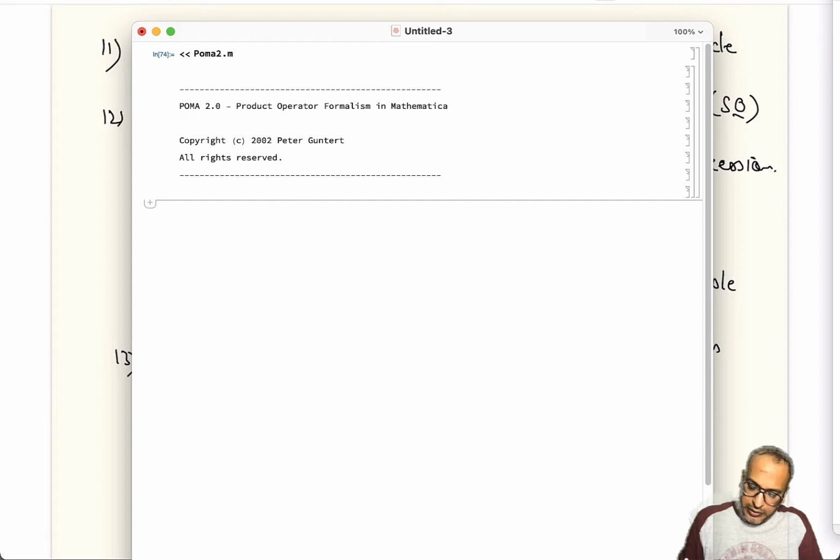So now, as we said, after we have called the package, let us start with nucleus. You should see that as you start typing, the command will start showing up. So nucleus 1 is equal to, let's call this h, followed by nucleus 2. This is also h. Let's say this is a homonuclear spin system where the two spins are h1 and h2.